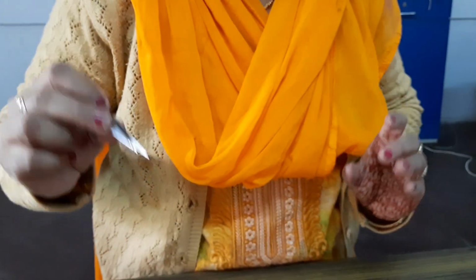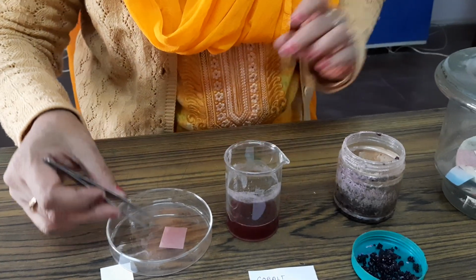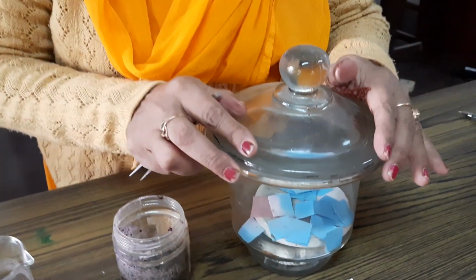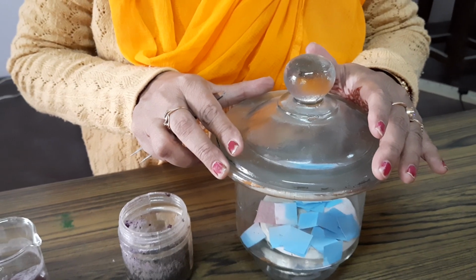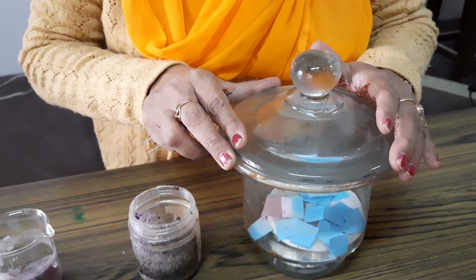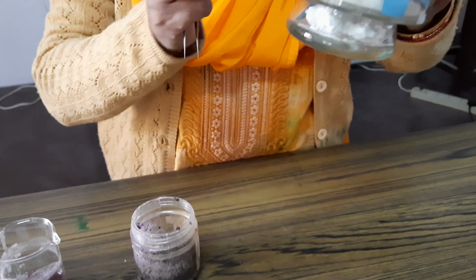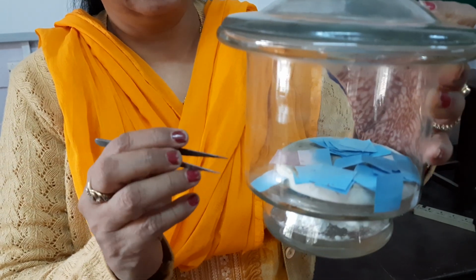I will place it here. Now this pink paper I will take and keep in a glass apparatus called a desiccator. A desiccator is a glass apparatus in which, on a net, there is a porcelain dish, a white colored ring-like thing like this, which you can see here, that is the porcelain dish, right?